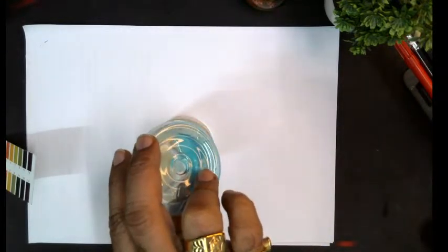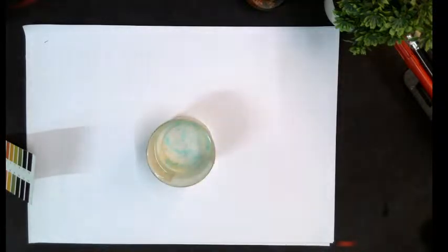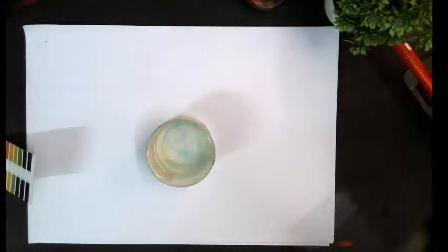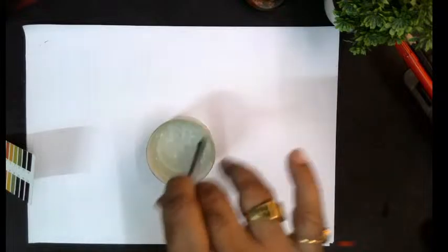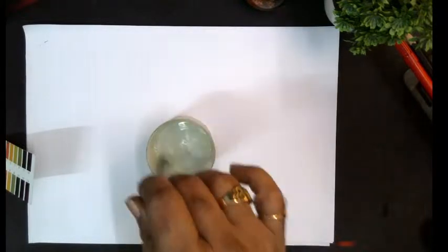Now let us check the pH after mixing it thoroughly. So it is expected to be alkaline. Let us check.